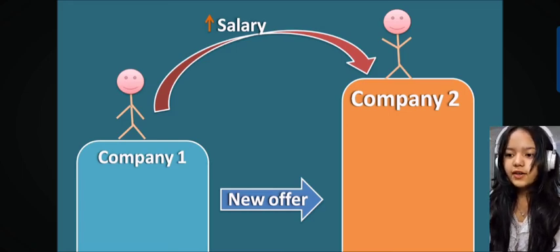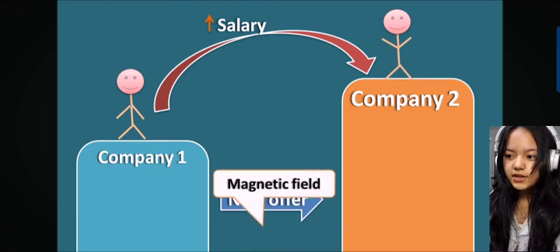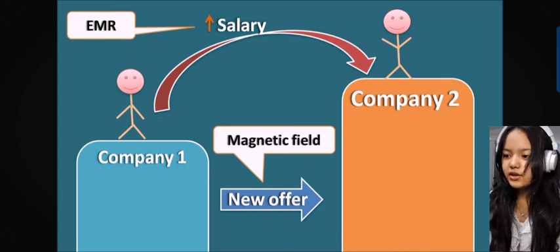So now that we can compare the situation to NMR spectroscopy, the new offer offered by the big company is nothing but the magnetic field applied, and the hike in salary is nothing but the energy we are giving in the form of electromagnetic radiation.